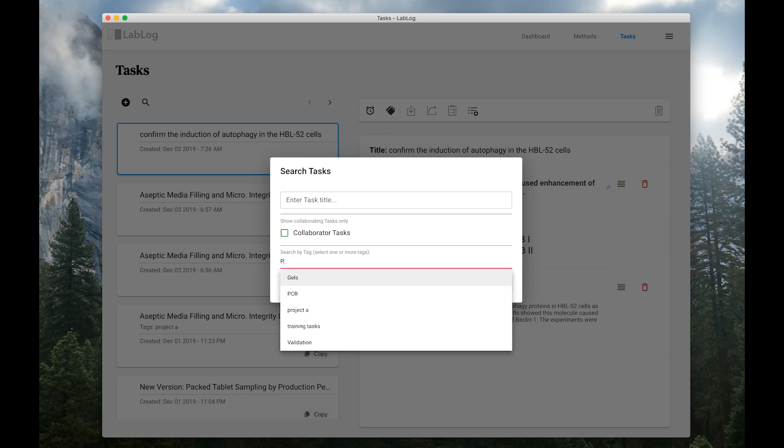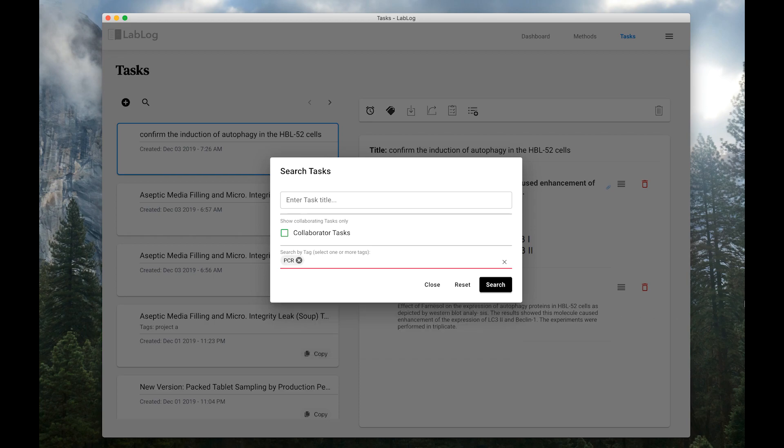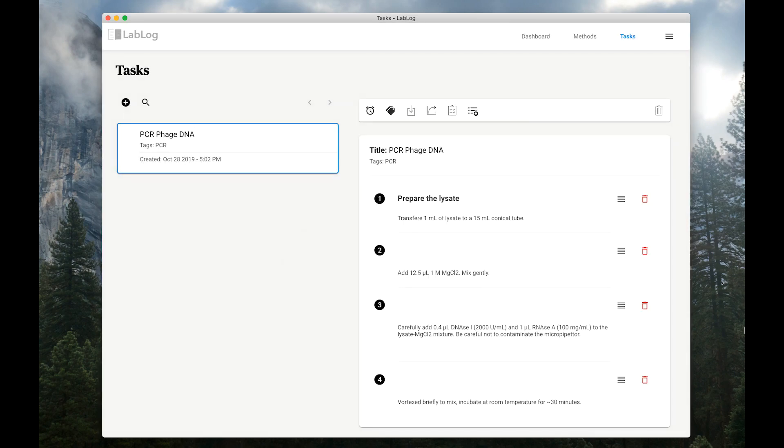You can assign multiple protocols and experiments to a project using tags. And if you need to find the notes related to a project, you can search by the project tag. You can also search by title and content. There it is.